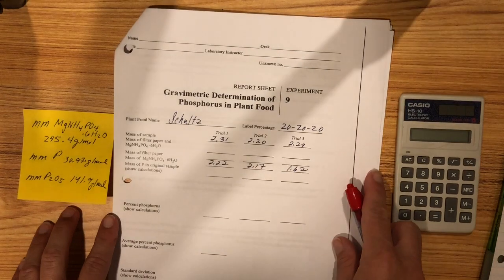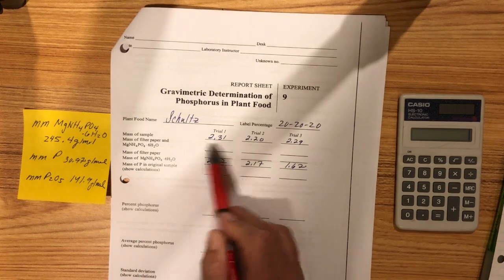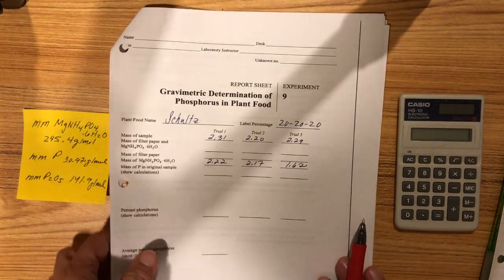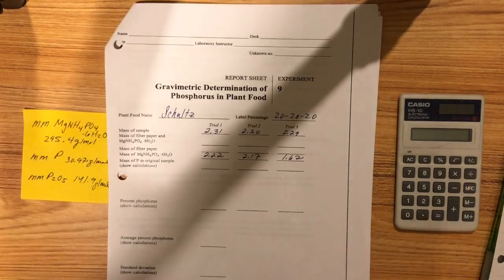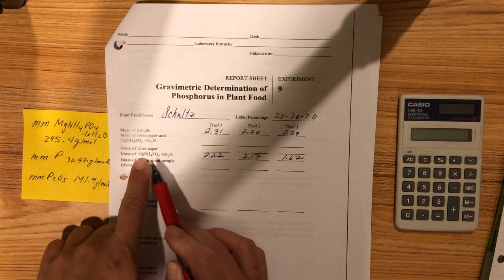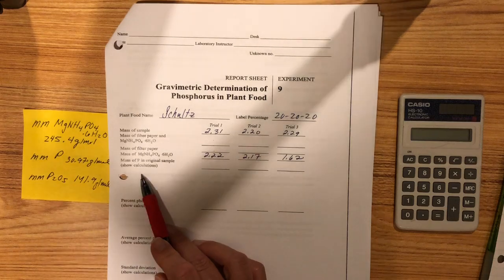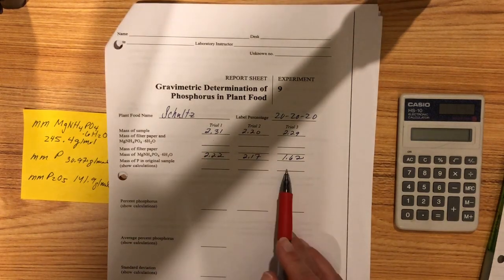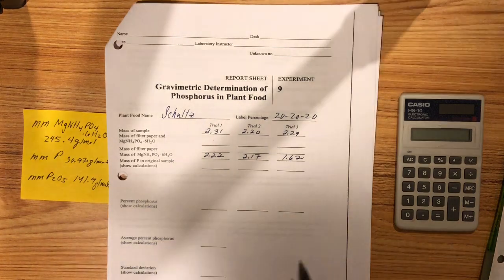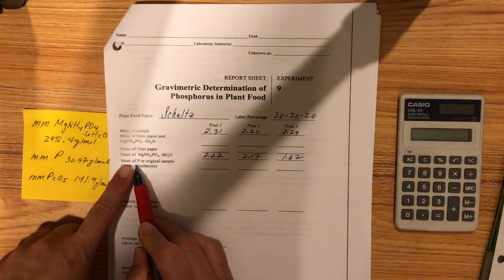Okay, so I'm moving over to this page where I have data, and you should have data too. Now, of course, in order to get this number, you took this number minus that number. That's why mine are blank. I just took the actual stuff that I needed. Okay, so it's asking for the mass of phosphorus in the original sample. So our first thing we're going to do is this is coming from the salt. So we need to figure out how much P is in the salt. What I'll do is I'm going to show you step by step through one of them, and then I'm just going to fill in the rest of the answers. And then you can stop it, do your work, and then move on. Okay, mass of phosphorus.